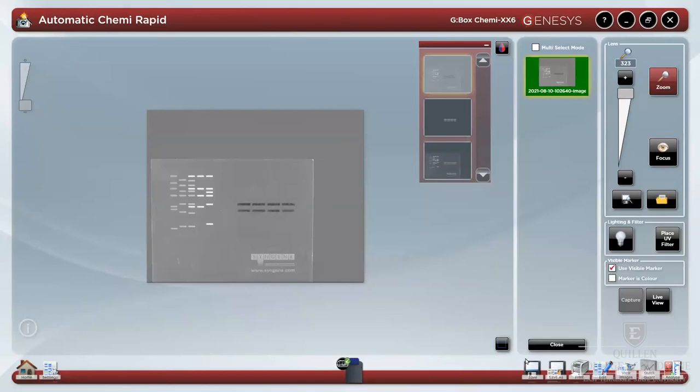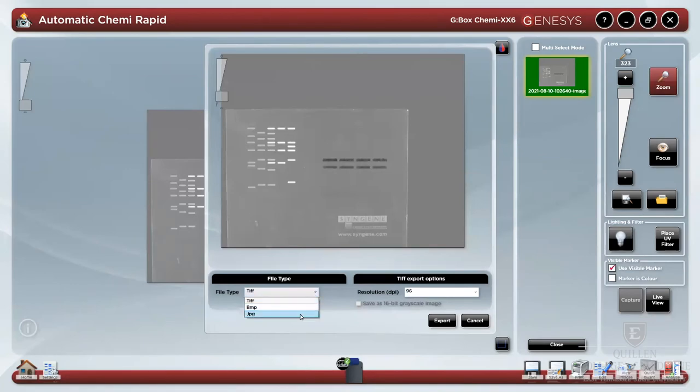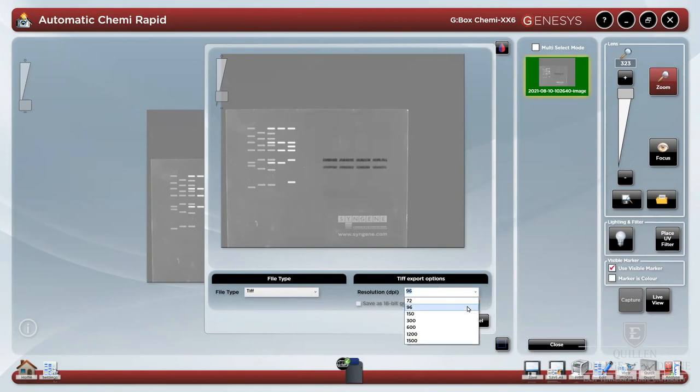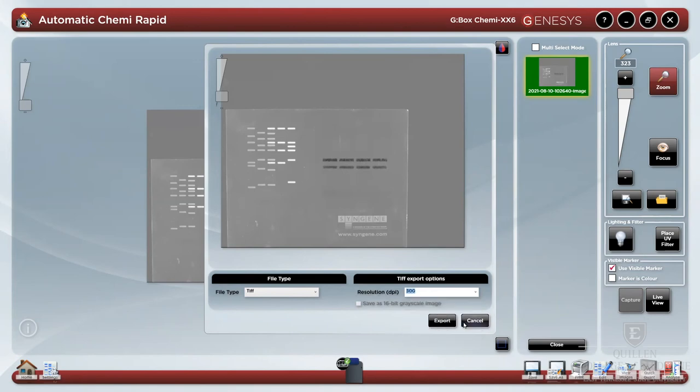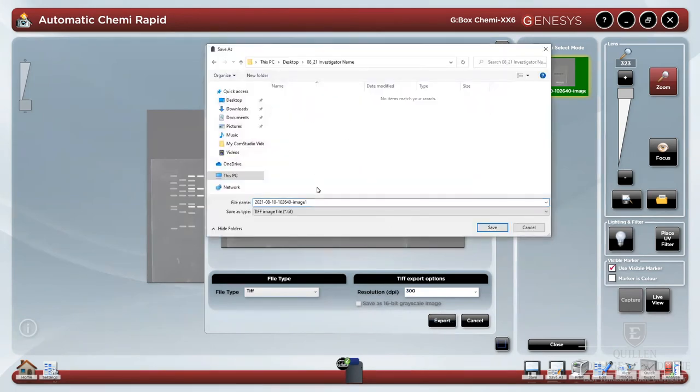You may also export your images using save as. Images can be exported as TIFFs, BMPs, or JPEGs, though JPEGs are not recommended as compression results in data loss. Be sure to increase your resolution to a minimum of 300 dots per inch to ensure your images have adequate resolution for printing. Save either to a folder with your name and date or to your own thumb drive and give your file a name that you can remember.